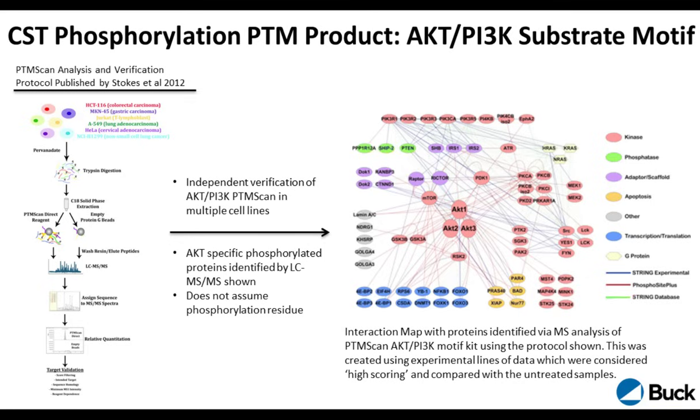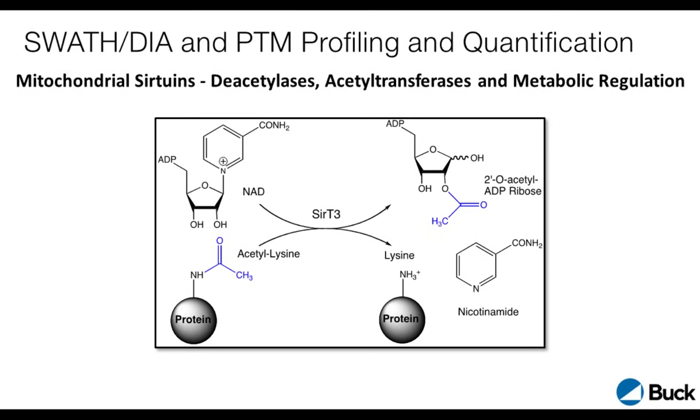And Matt had shown you there's a suite of phosphorylation antibodies also available. Here is a paper from Matt. But I wanted to show you some of our own work that we have done over the years, particularly looking at acetylation here.